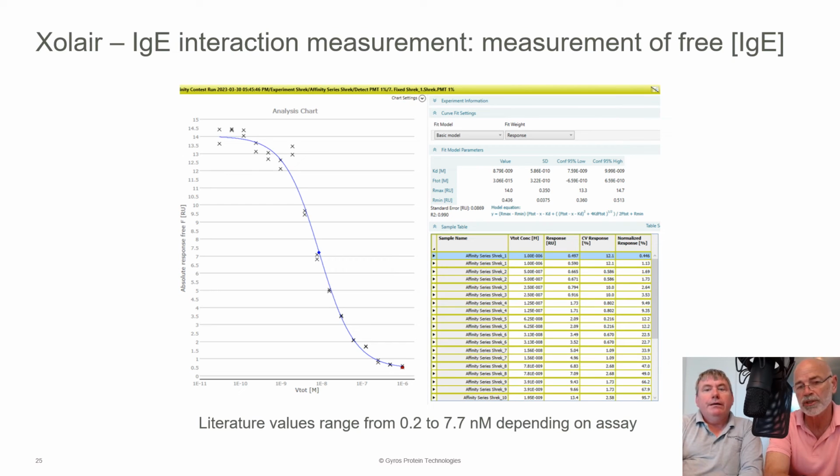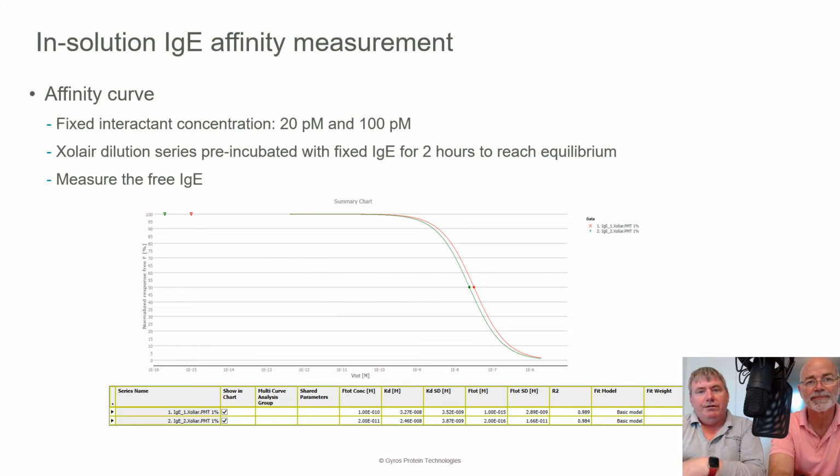First thing I'll do is check to make sure there isn't anything that's wildly out in terms of CV between the replicates. And if I see that, then I'll, as I normally would, check the viewer profiles to make sure that the images look good. And if all is good and I don't see any wildly out CVs, then I'll be able to proceed with the analysis. So here's another example.